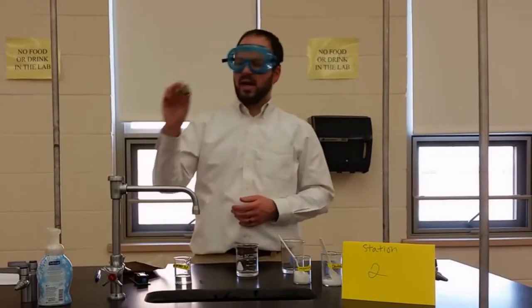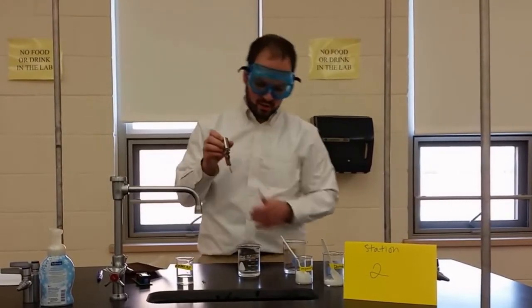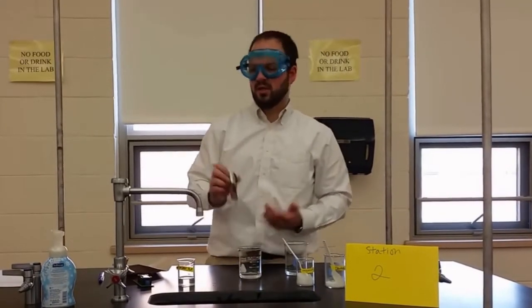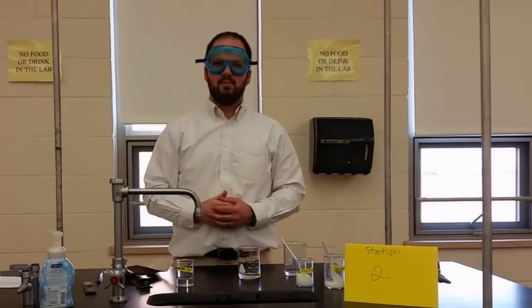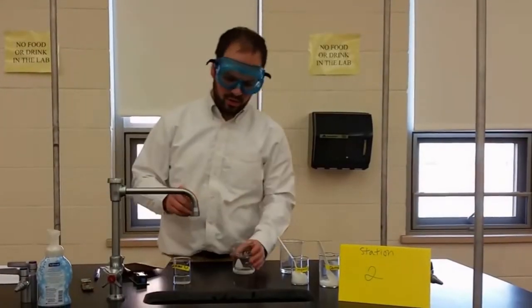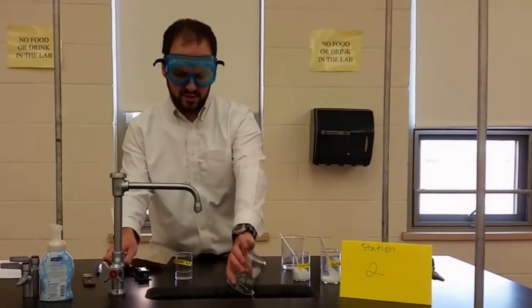Just to point out, I actually have a conductivity meter here that you don't get to use, but this one makes noise. And if we put the two metal probes from this one in, you can hear that it's conductive. All right, at this station, the way you clean up is just to pour the chemicals in the water down the sink and rinse it.